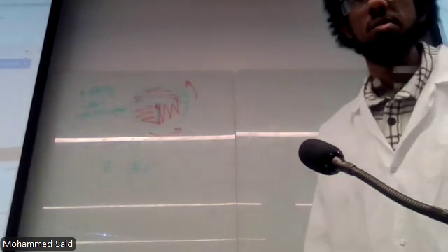Remember, everyone, aseptic technique, especially when it comes to the line. We want to make sure that once it's returned back, we're able to complete and make sure that we're doing everything else right.